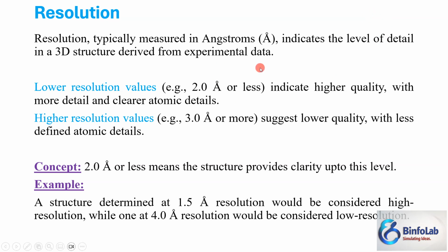It explains the details in a 3D structure derived from the experimental data. What is experimental data? I explained in my previous slide that it is the data of electron density maps received from the XRD experiment, which shot the protein crystals.